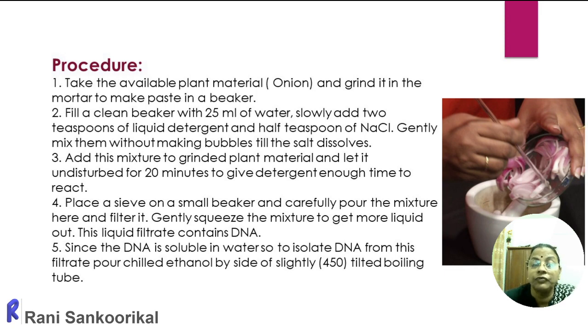To that you have to add the crushed or ground onion paste, the ground mixture, and again stir it thoroughly without allowing the formation of bubbles. That is very important. The bubbles will interfere with the result.